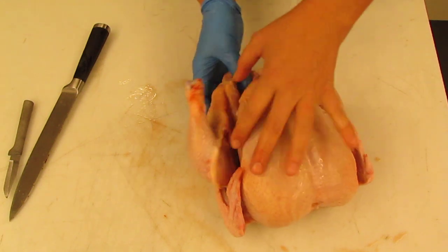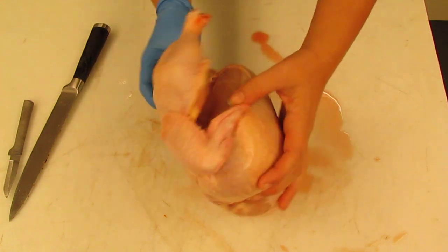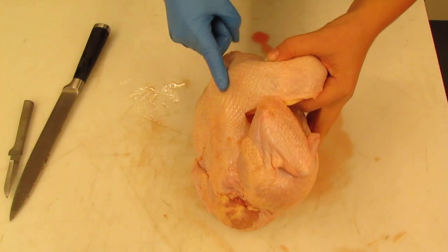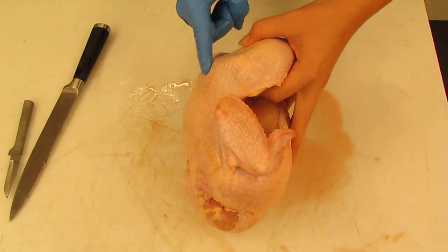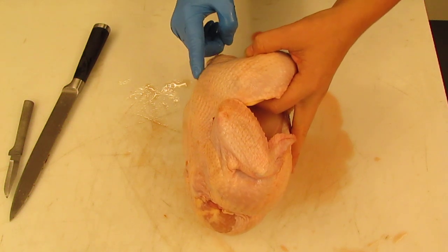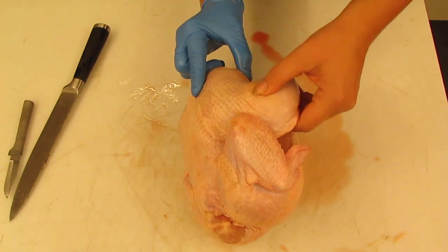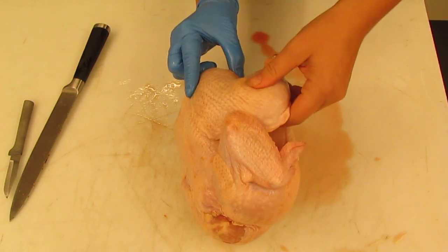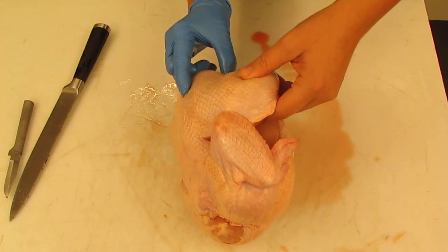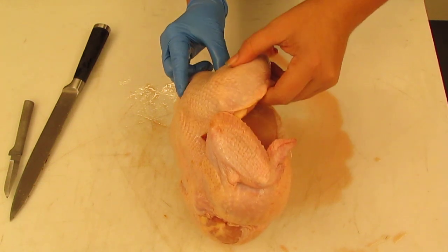Okay, next we want to separate the entire leg from the rest of the body. And so to do that, you should run your finger along the back of the bird. Okay, note this is the thigh, this is the back, here is the sacrum. Okay, if you move the leg like this, you can feel the hip joint, right? So this is the greater trochanter and the head of the femur, and I can feel that it is moving as I move the leg, okay?